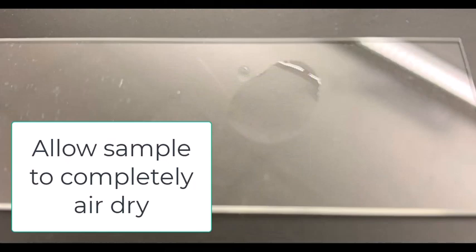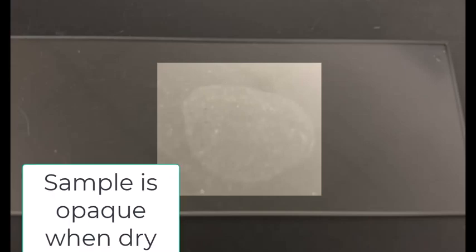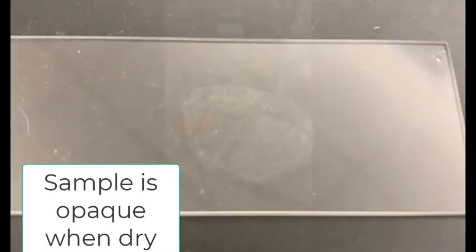Whether you were working from a broth culture or an agar culture, you should now see a thin, even film, the area about the size of a dime on your slide. You'll need to allow that to thoroughly air dry. You'll know it's dry when it takes on an opaque look.